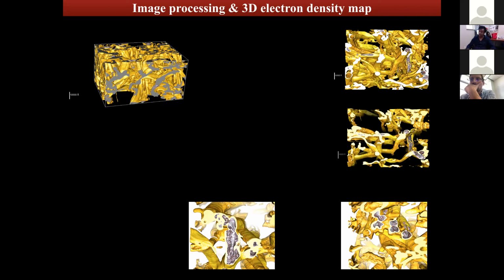However, the information that is not available at this stage is the inside detail of the cells. So for that, we switch to the next higher magnification. We select an area and start collecting more data at the higher magnification. Now, while you are setting up the recipe, you usually collect the data set the first time to get an overview of what the sample looks like.